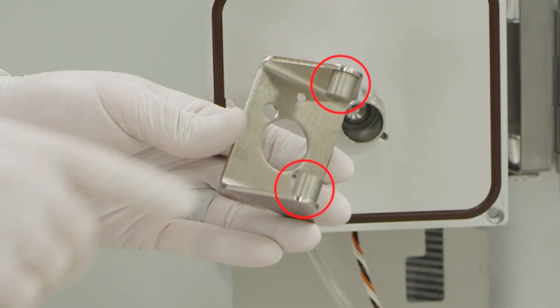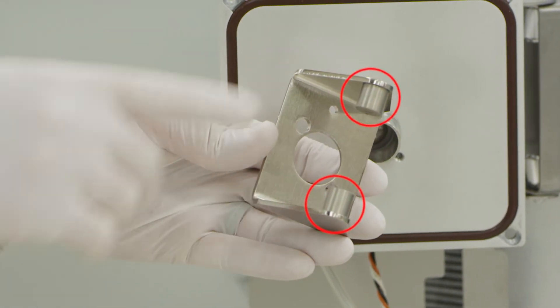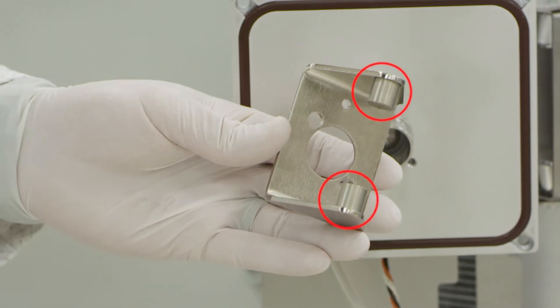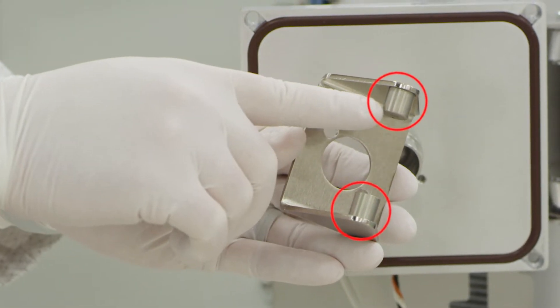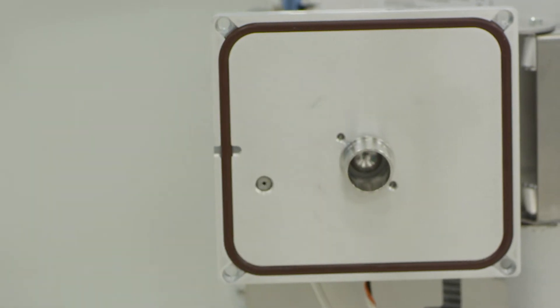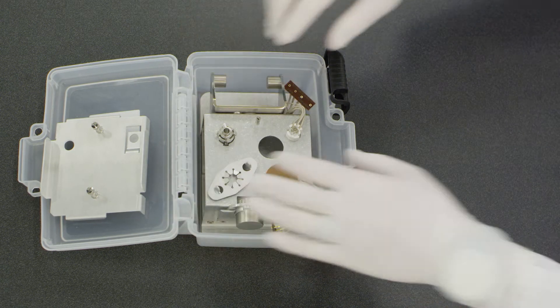Do not remove the magnets from the yoke. Note, these are strong magnets that should be handled with care. They should be kept at least 6 inches or 15 centimeters away from sensitive electronics and medical devices. Place the yoke into the designated location in the source box.